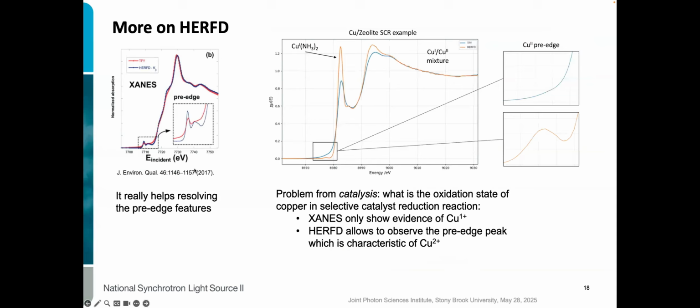Okay. So one thing in the spectrum, in this diagram of the spectrum, I wasn't talking about in much detail is this pre-edge region. So when you're scanning the spectrum, you hit all kinds of transitions from 1s to 2p, 3d. Those transitions are actually not allowed per quantum mechanics.